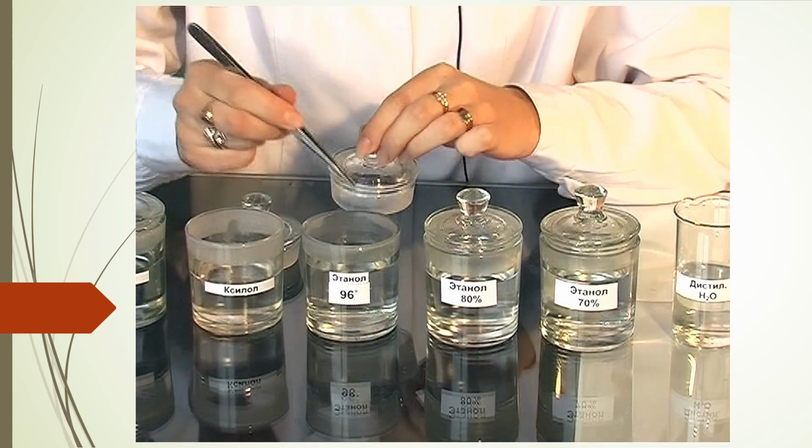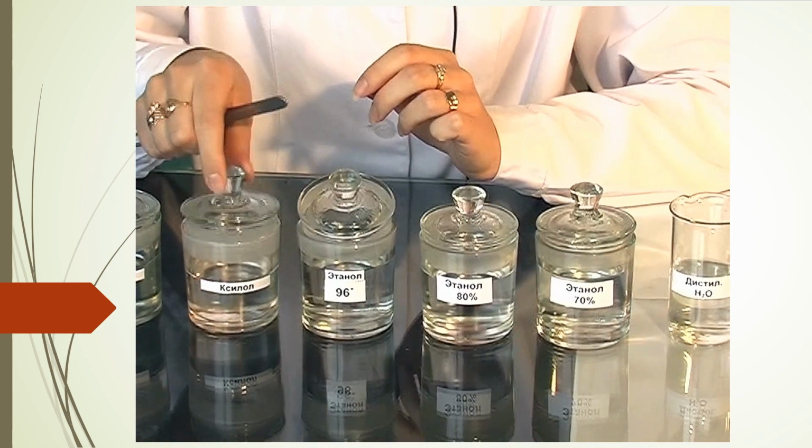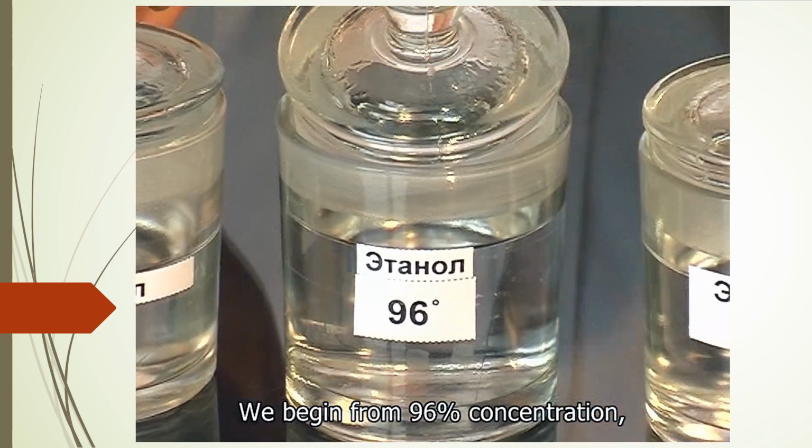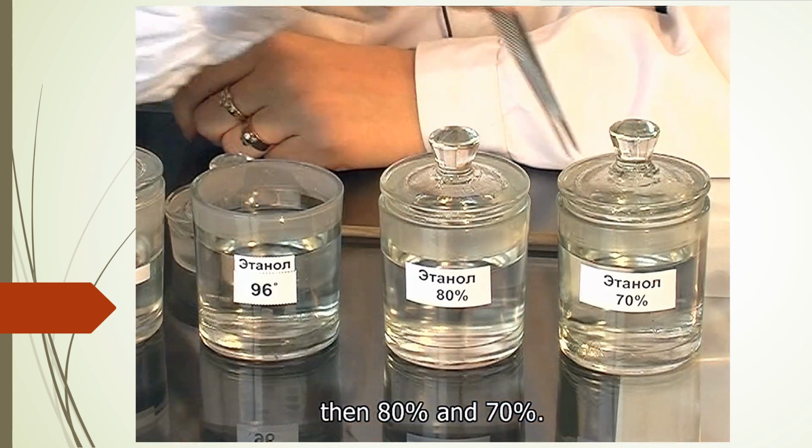After that, the slide is passed through alcohols of decreasing concentration. We begin from 96%, then 80% and 70%.